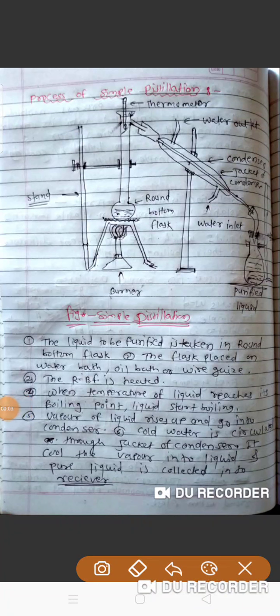Okay, students, now consider the process of simple distillation. In the last video we discussed simple distillation and its setup, and what it is used for. What is simple distillation?